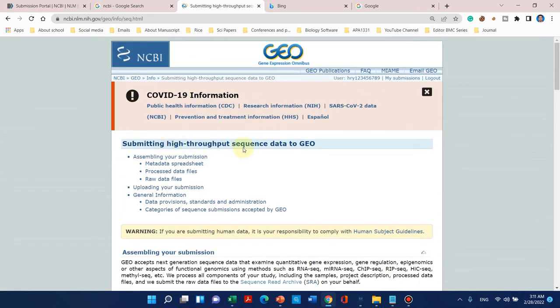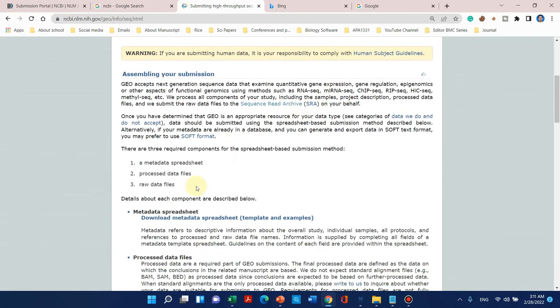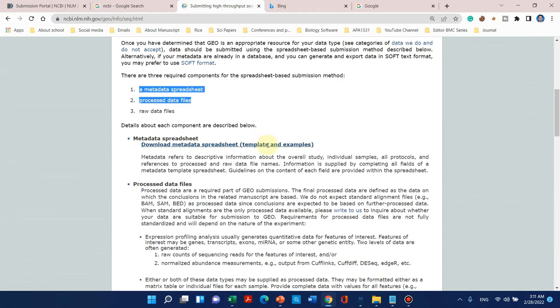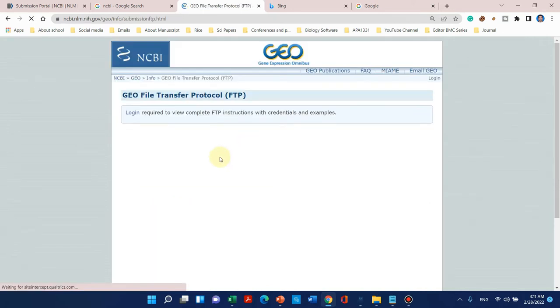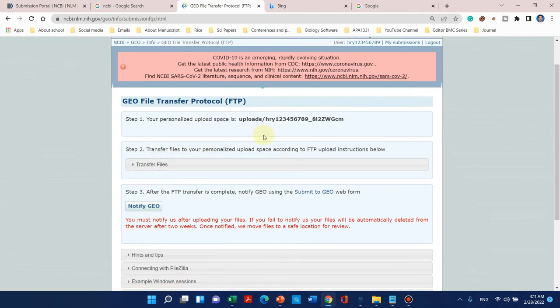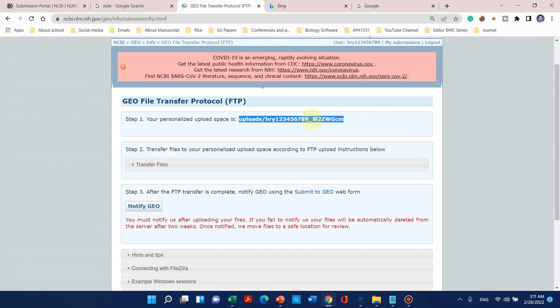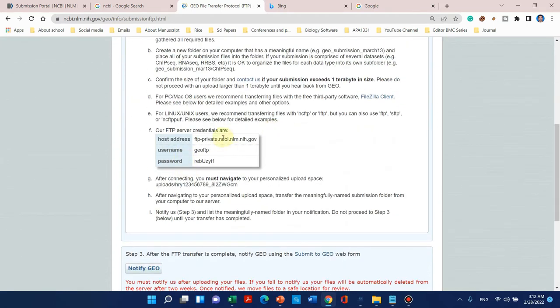When you click on 'Submitting High Throughput Sequencing Data to Gene Expression Omnibus,' you need three things. Here you can see 'Uploading your submission — transfer all of your files to the GEO FTP server.' This server is linked with the NCBI database. If you are logged in, you will see your folder, but I don't recommend using this folder for RNAseq data submission. If you are using high-throughput Illumina sequencing, then this folder can be used.